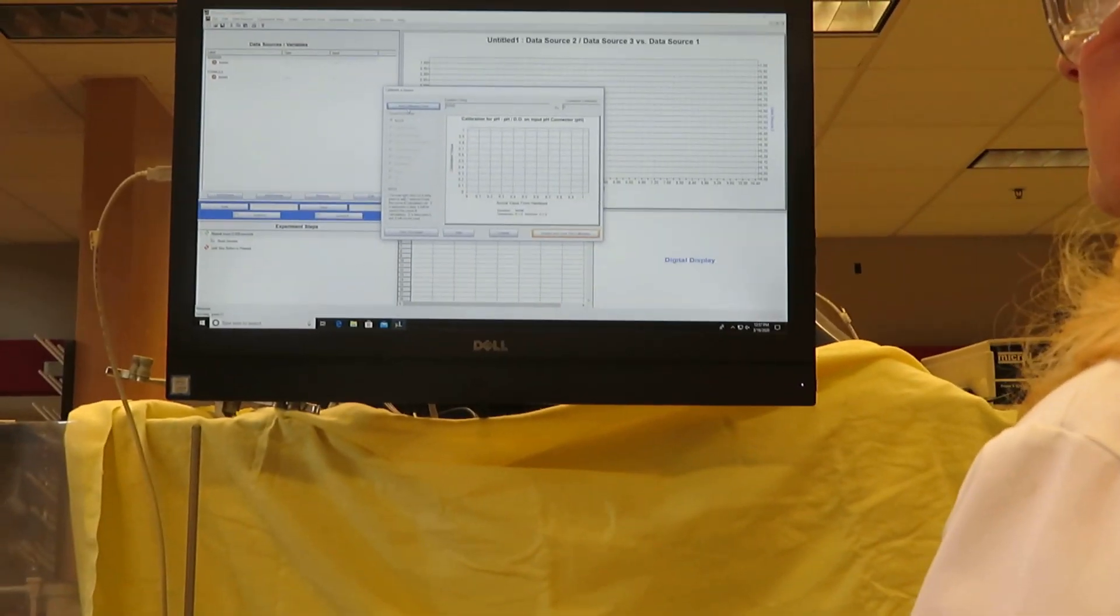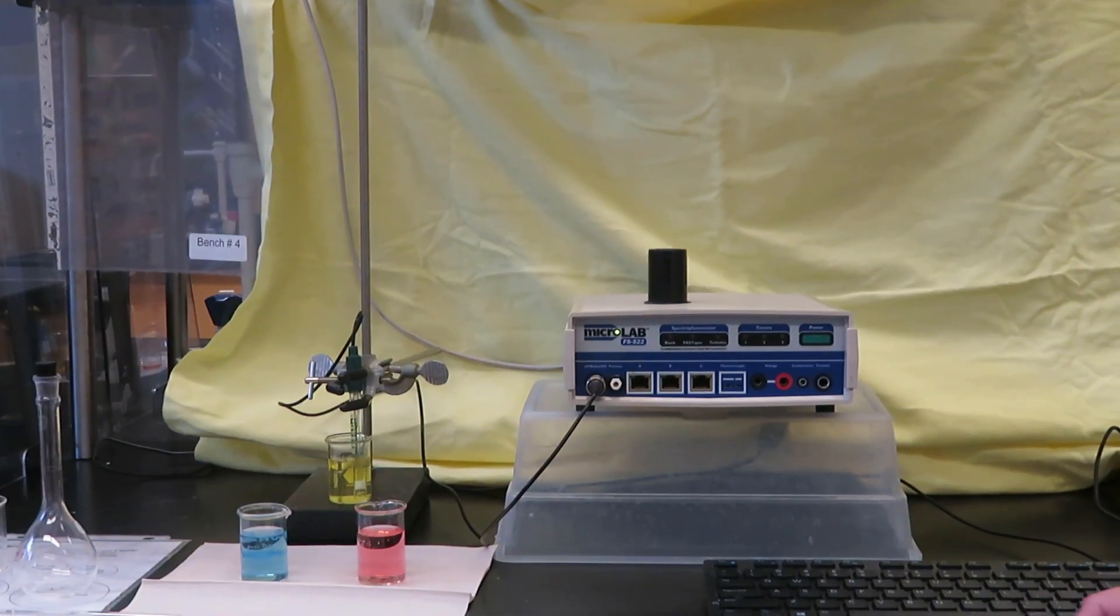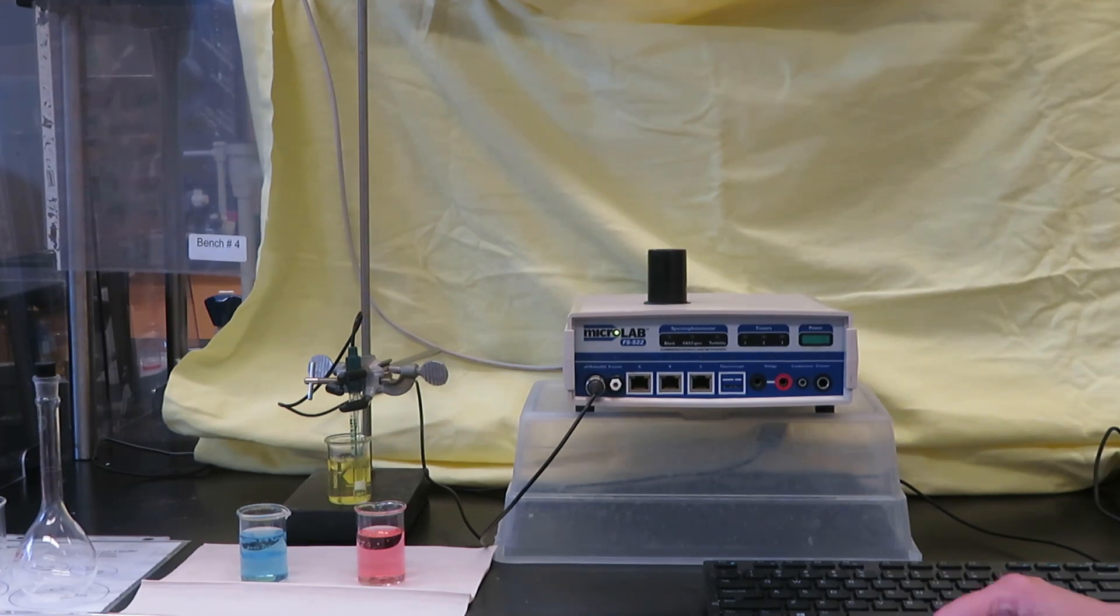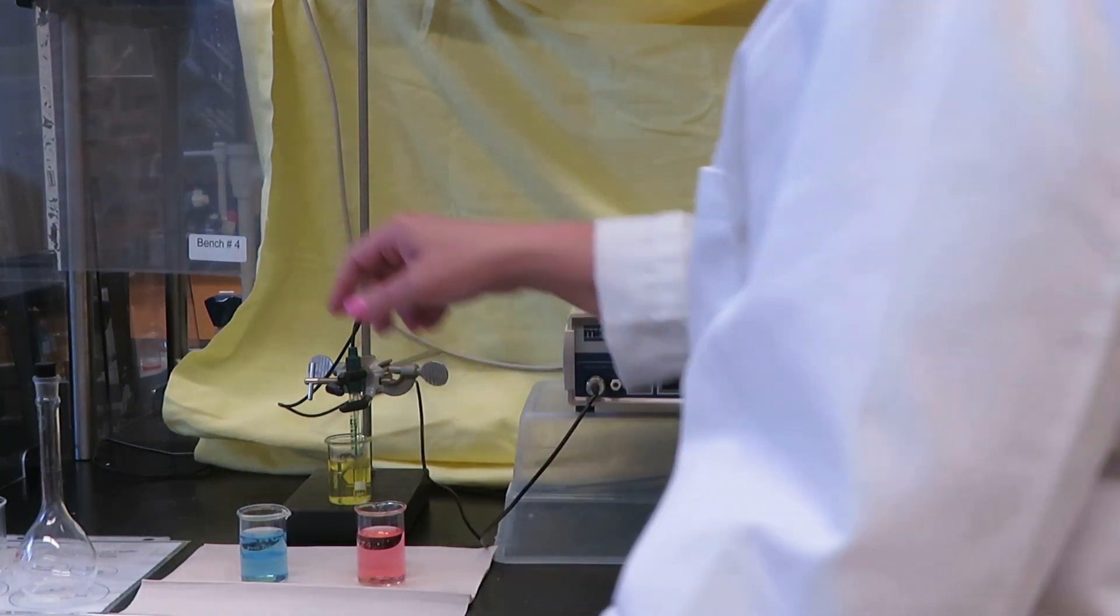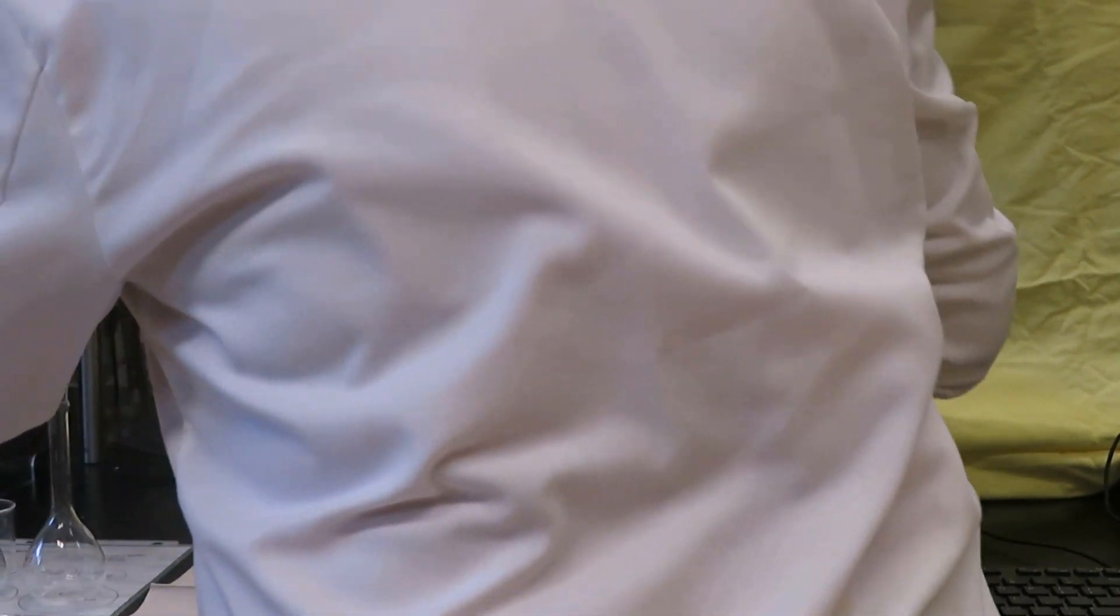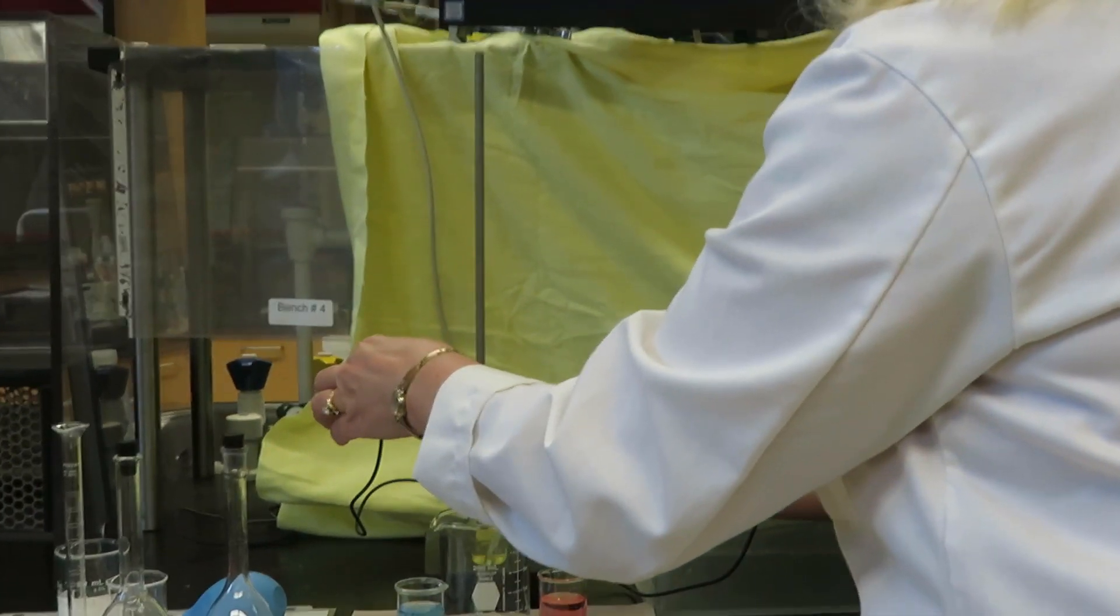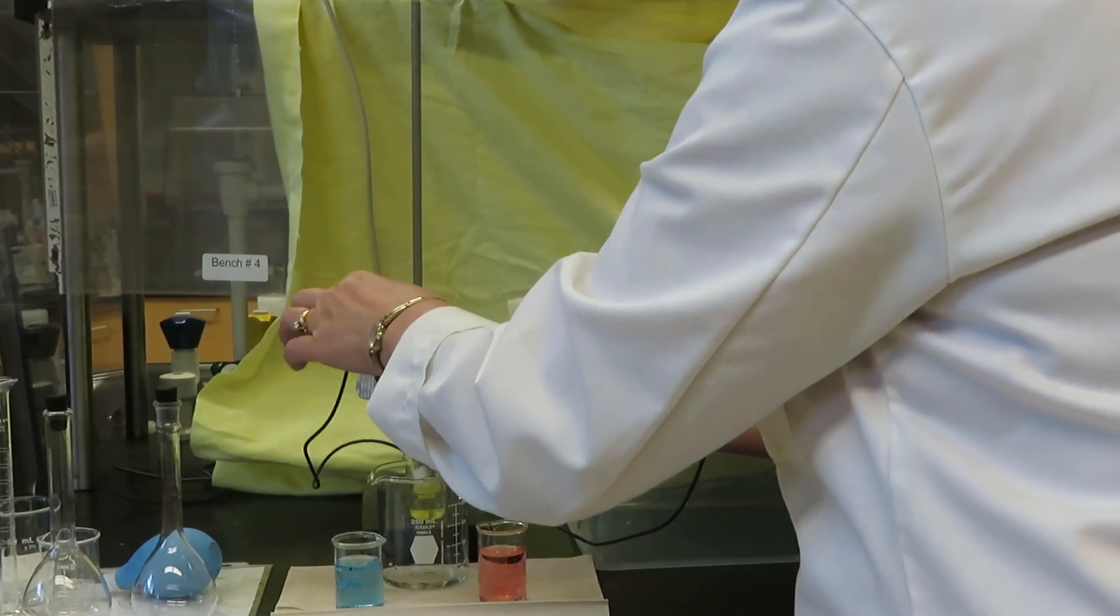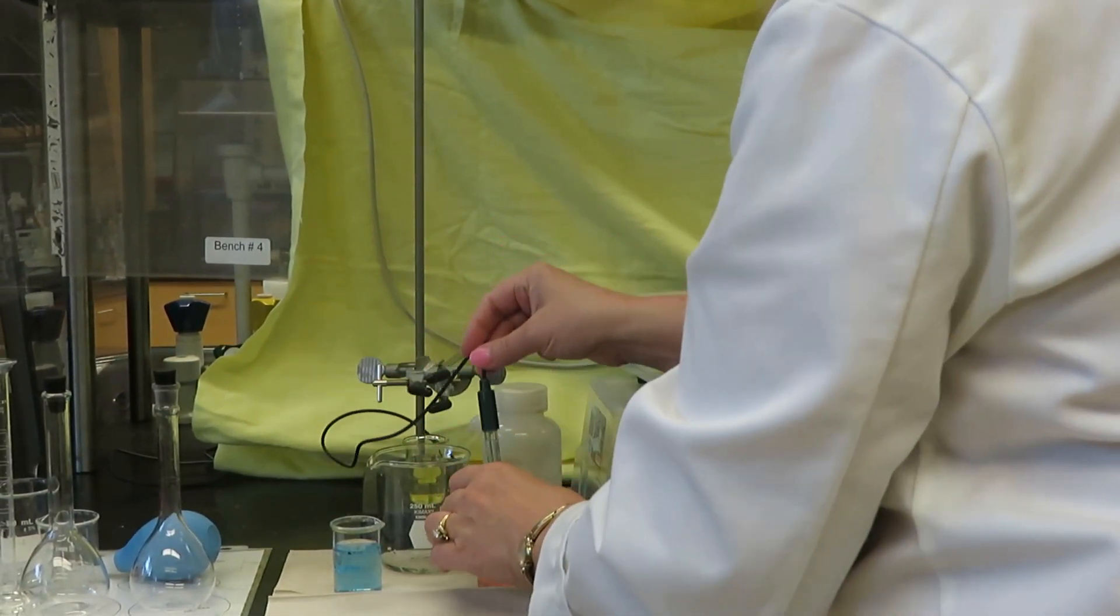First we will add a calibration point. We're going to start with pH 4 buffer, which is this red solution right here. I'll take my DI water and waste container - it's always good technique to rinse off the probe between solutions. Let me take the probe out of the pH 7 buffer, give it a shake, and now put it in the pH 4 buffer.